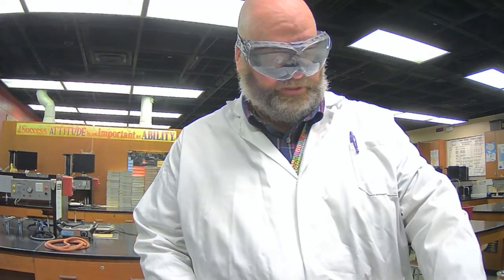As we do these measurements, we're going to start with marbles, okay? It doesn't matter how many we begin with. In this case, there are 4, but it just needs to be a number of them. We don't need to divide by 4 to figure out the mass, okay? It's mass divided by the volume. So the density of each of these marbles should be the same because they're all made similarly. All right, so I'm going to drop them onto my scale.